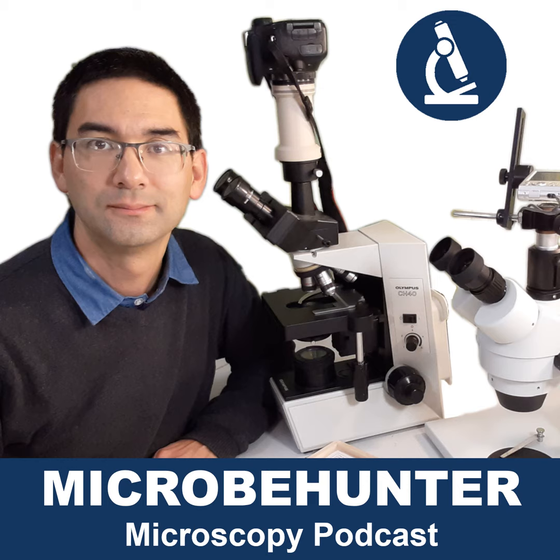for several reasons. First of all, you get the widest field of view, so you see a lot of the specimen, and therefore it gives you orientation, and you can then recenter the slide in such a way that you're able to have a look at certain parts that you want to look at. But it's always a good idea to get an overview first.